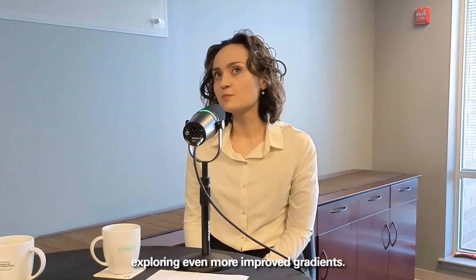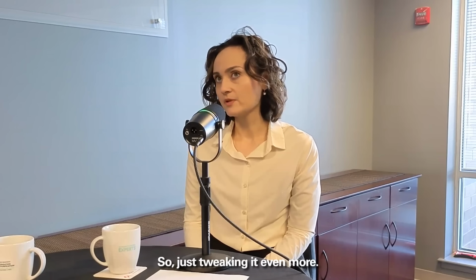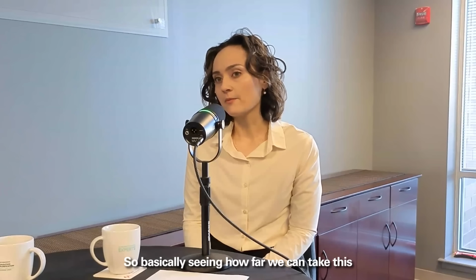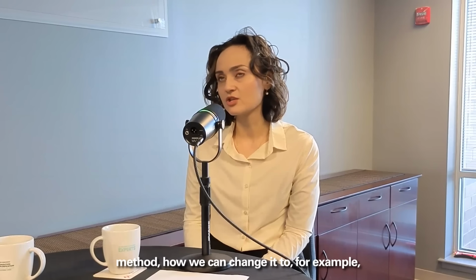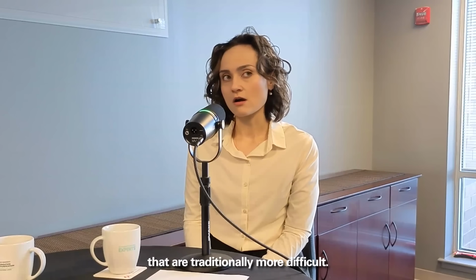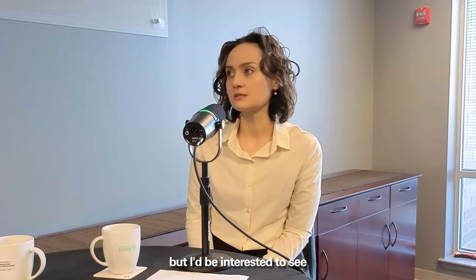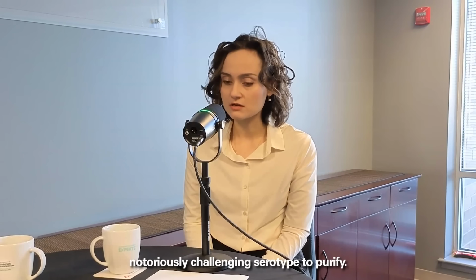Sure. So I'm interested in exploring even more improved gradients, just tweaking it even more. We developed this as a case study, basically seeing how far we can take this method, how we can change it to, for example, deal with some of the more challenging serotypes, ones that are traditionally more difficult. For example, we didn't do this for AAV9, but I would be interested to see how AAV9 can perform here, because that's a notoriously challenging serotype to purify.